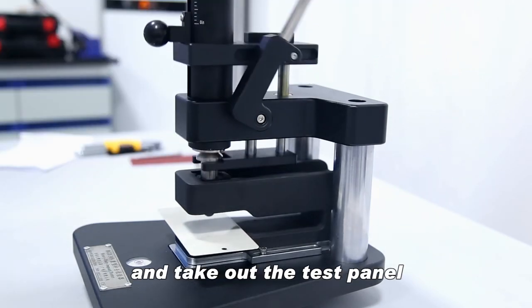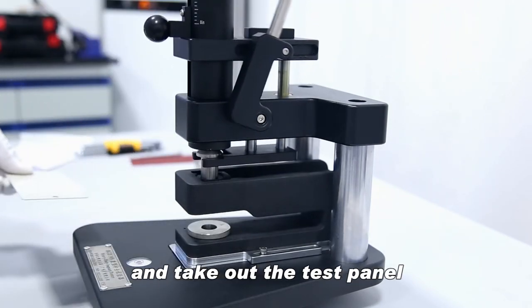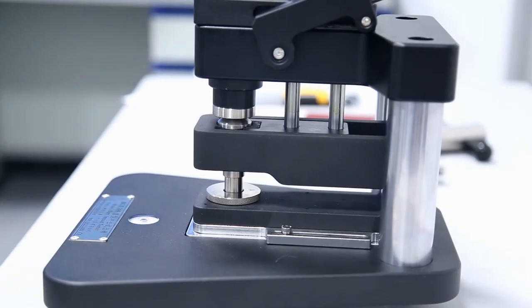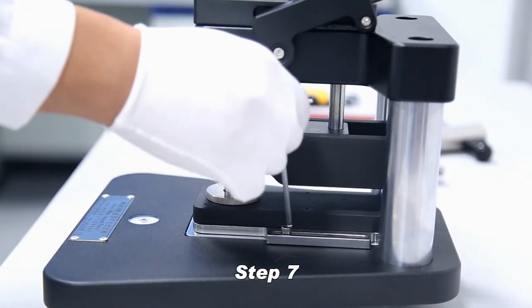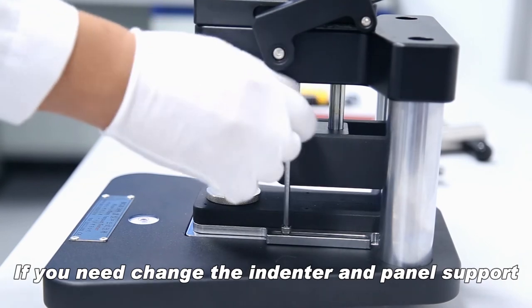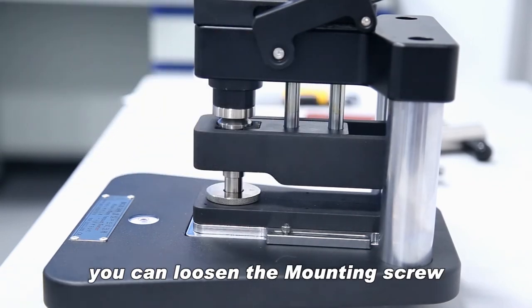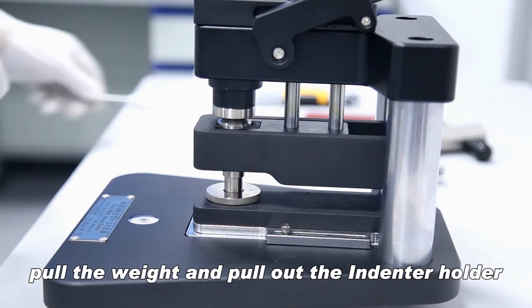Take out the test panel. If you need to change the indenter and panel support, loosen the mounting screw, pull the weight, and pull out the indenter holder.